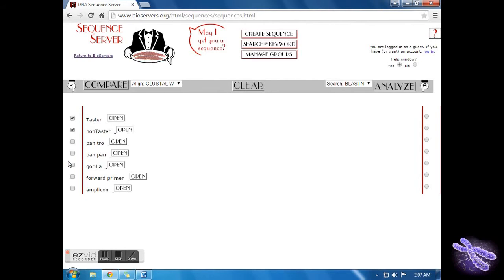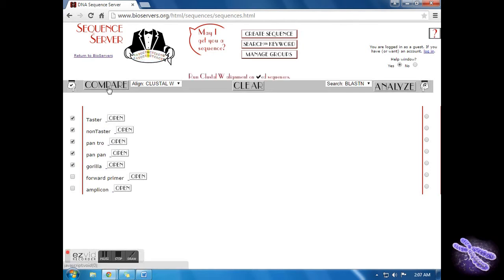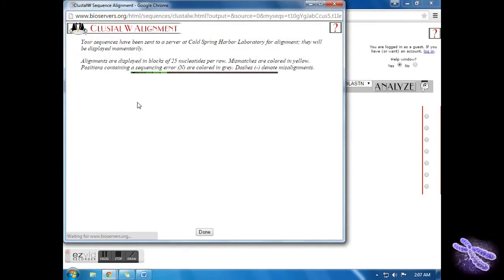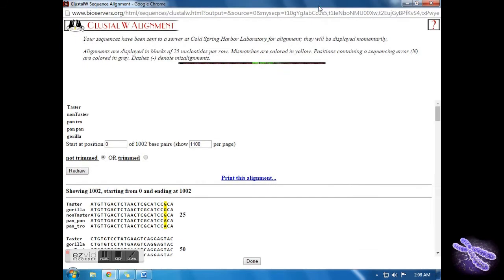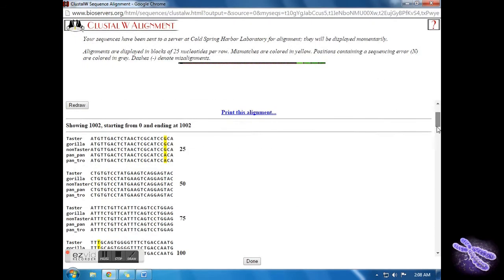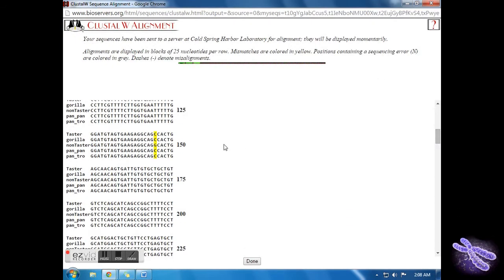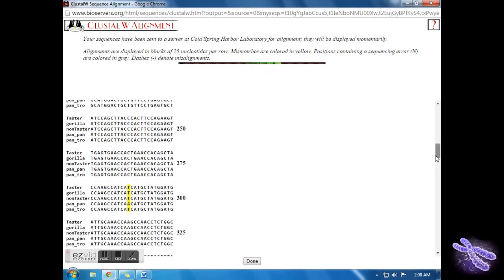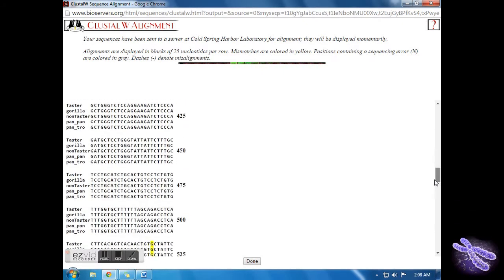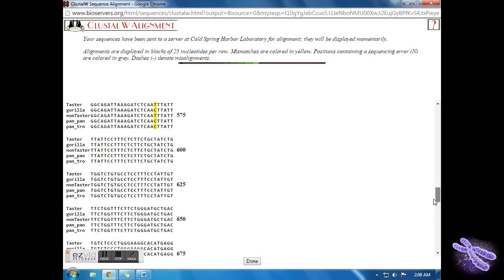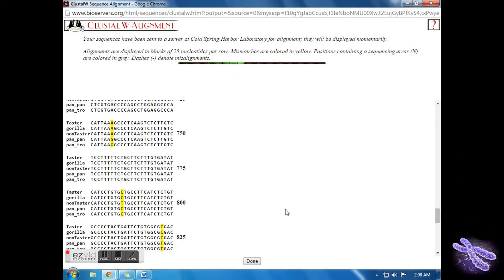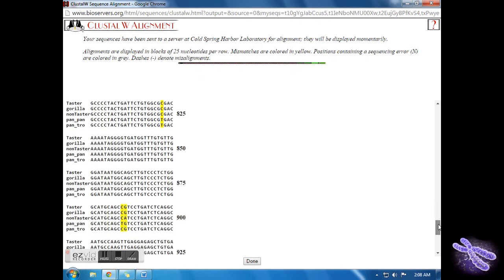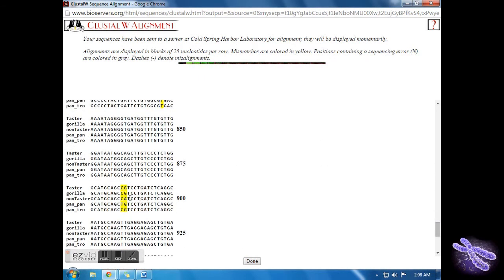Exit out of the window. Select Pan troglodytes, Pan paniscus, and Gorilla to compare them. Look at nucleotide positions 145, 785, and 886. Notice which one is the outlier in each case and what this means in regards to the ancestry of this gene at each SNP.